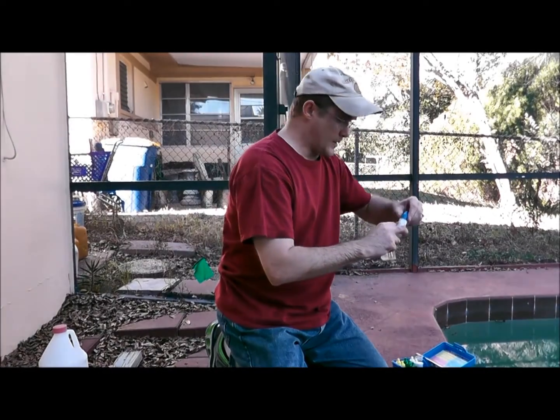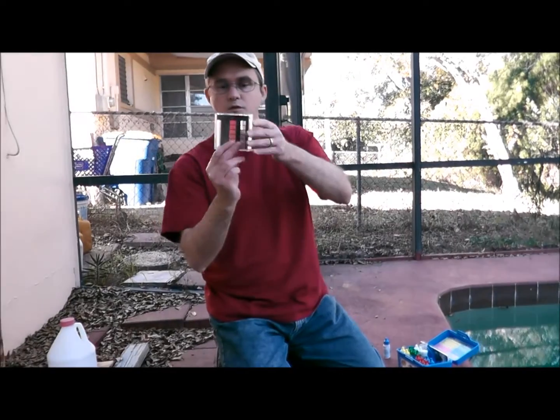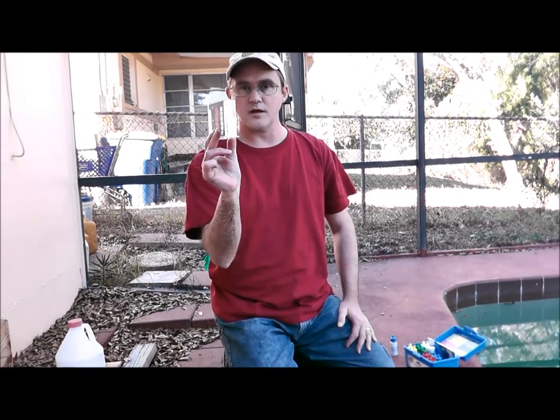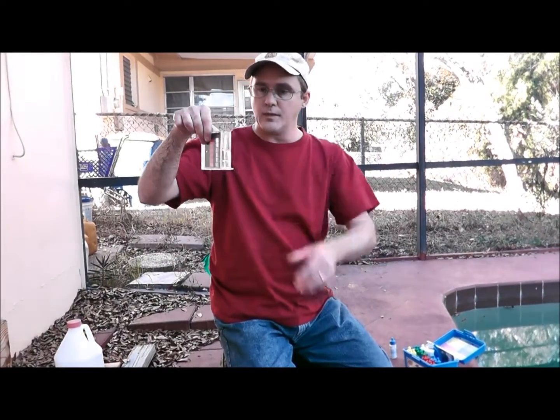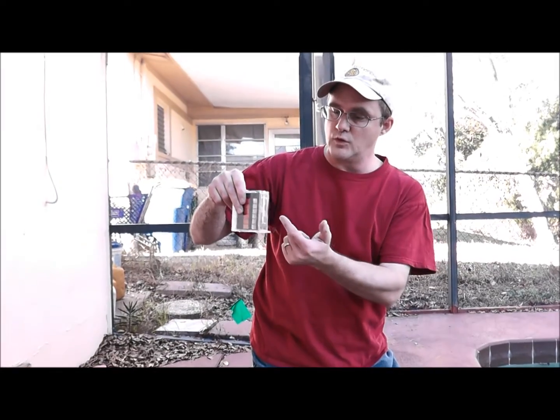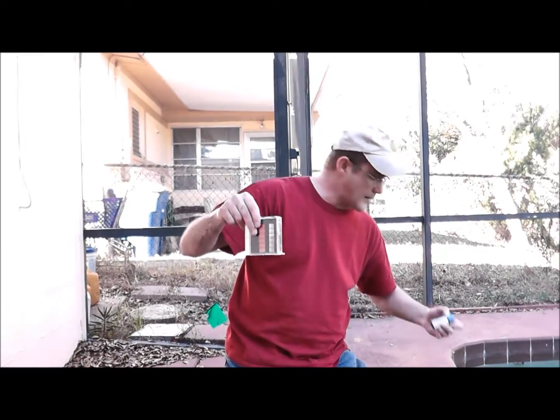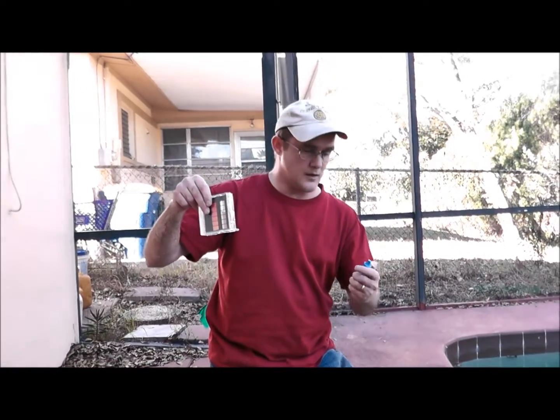Then swirl to mix. When you swirl, don't hold it down low and slosh it around, and don't hold it up high and slosh it either — that does nothing. You want to get a good vortex going. Hold it up and give it a proper swirl. Next is the calcium indicator, the R0011.